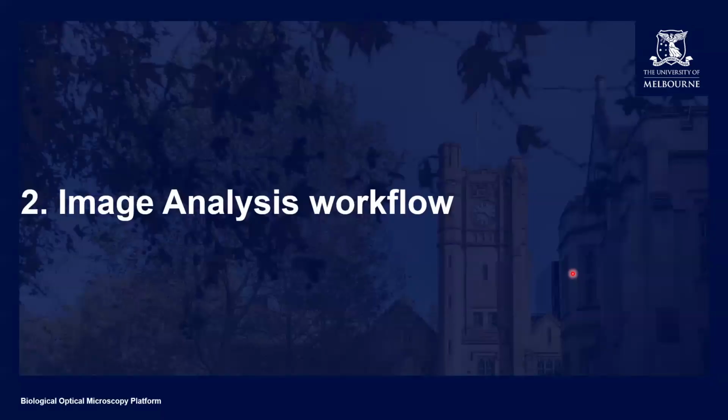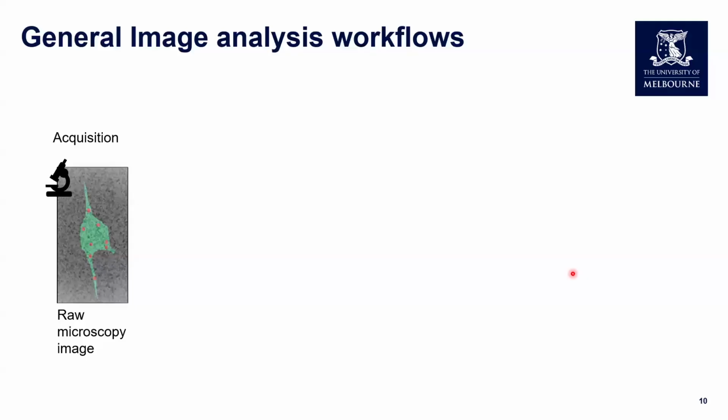So now let me get to the second part, introducing the general workflow of bioimage analysis. Let's say we have acquired a raw microscopy image like this.